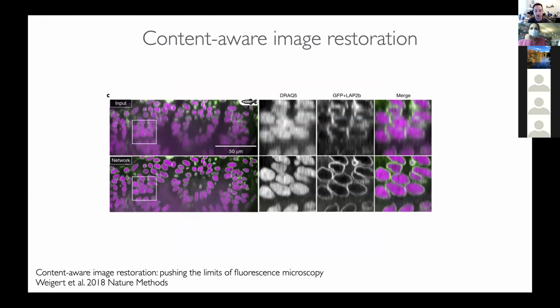And the other thing that's being used for is increasing resolution. So this is a really good example where they've imaged with larger step size, or lower resolution in the axial dimension, which is very common for confocal microscopy, but trained it with data that's isotropic. Then the model becomes quite good at predicting, interpolating, what those slices should be, and so this can be a shortcut to getting you nice isotropic data for segmentation and measurement.